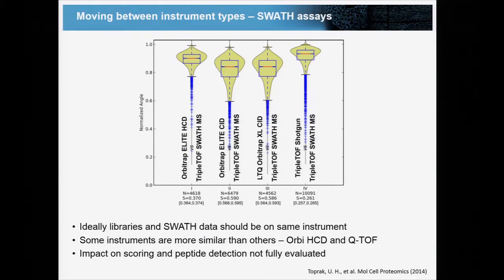So some instruments are more similar than others. HCD seems to be quite similar to QTOF. This is more or less expected. If you want to make these comparisons yourself, you can use this tool, but really the impact on scoring and peptide detection is not fully evaluated.